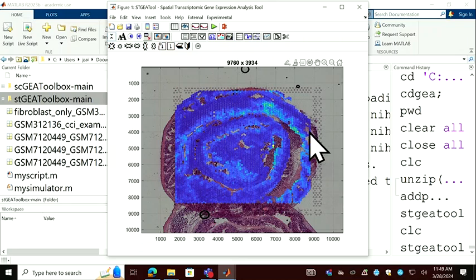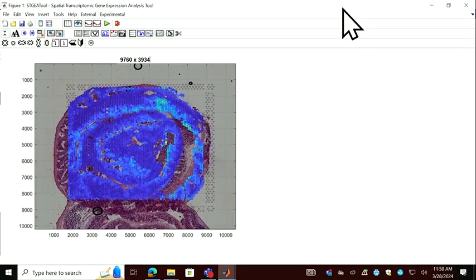It's very similar to single cell RNA-seq, but here it's not the cells, it's just spots, single spot analysis. You get rid of so many genes, only have 9,000 genes whose expression level is high enough.